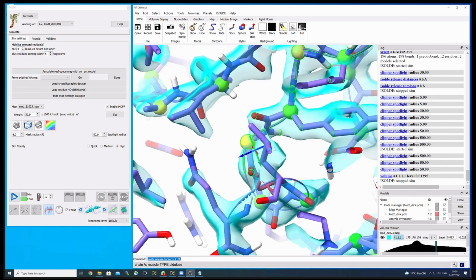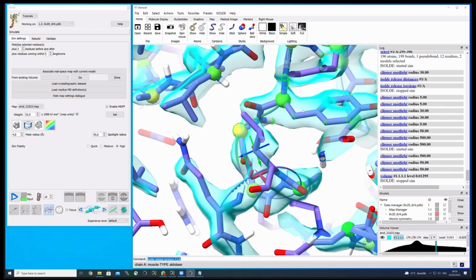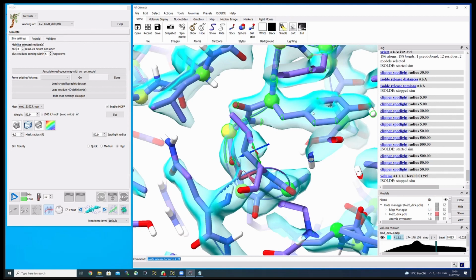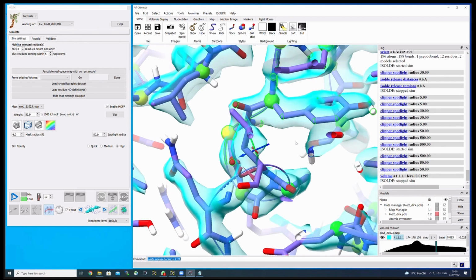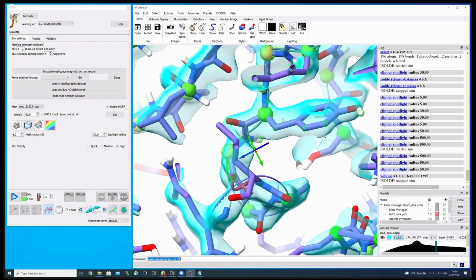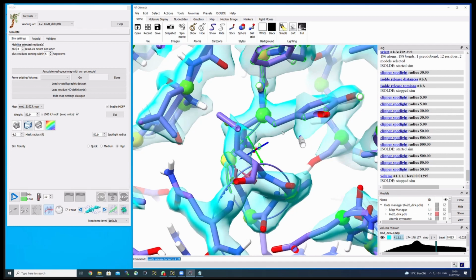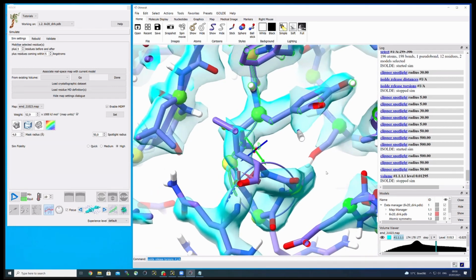And this is what I would actually highly recommend to do for now, to practice the eye and the density to build into a map in which the sidechain density is very, very clear, because that will help you to judge later densities that are not that, let's say, nicely resolving the sidechain residues in your structure.